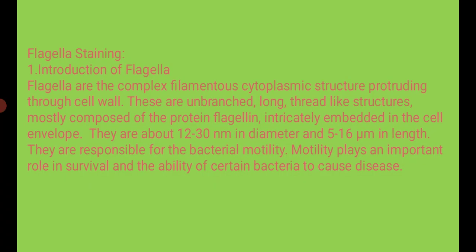The flagella are hair-like helical appendages that come out through the cell wall and are responsible for the motility of the organism. Many rod-shaped bacteria and a few coccus-shaped bacteria like Planococcus and Nitrococcus possess flagella, and by means of flagella they are motile. The organisms which have flagella are called flagellated organisms, whereas the organisms that do not have flagella are called non-flagellated organisms.